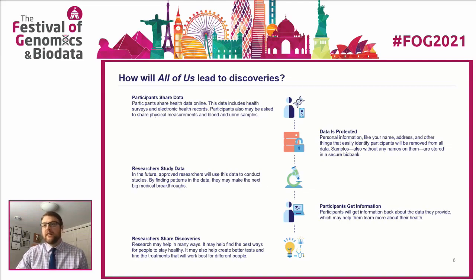Physically, the biosamples that are collected are then shipped overnight to the Mayo Clinic in Rochester, our biobank for the program, where we process and store most of the samples in our robotic freezers in a very secure manner, and completely de-identified, I should mention. The only ID that's on a tube is a barcode, and you have to travel many data sharing linkages away before you're ever even closely able to determine who that sample belongs to. So really the anonymous factor of each of the samples in storage is also a way for us to build trust and encourage participants to donate their biosamples to us.